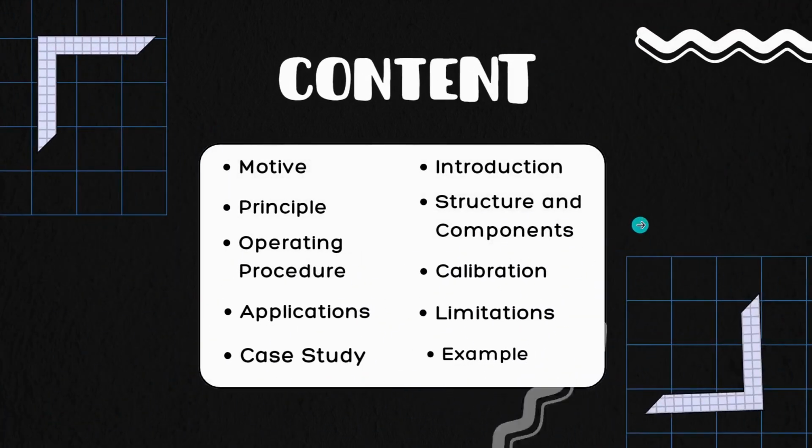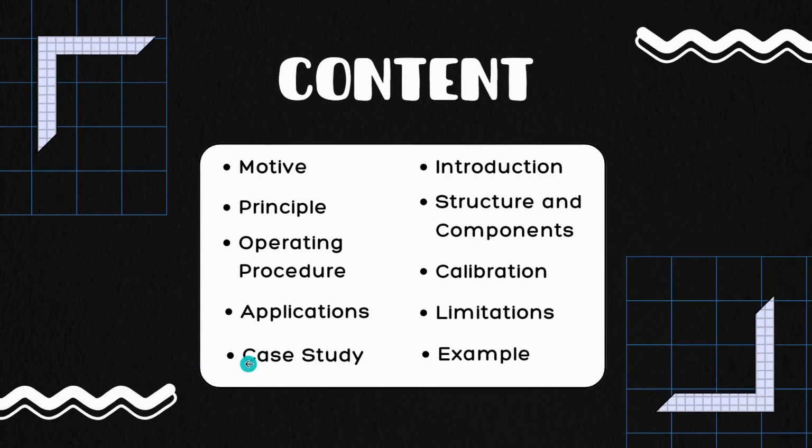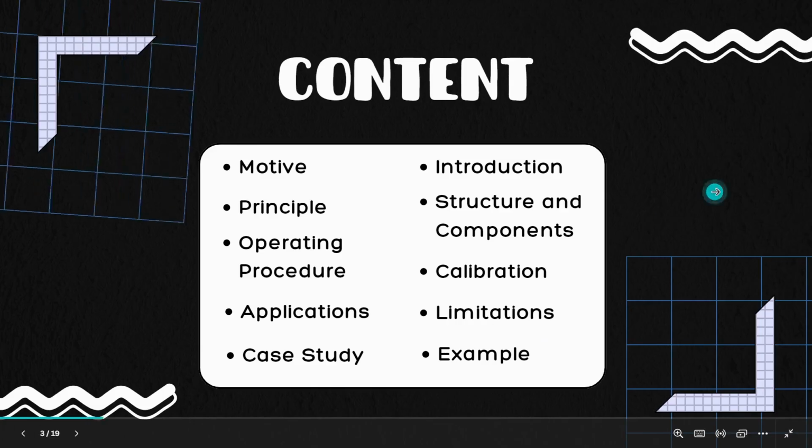So let's see the content in the presentation. First is the motive, second is the introduction, then principle, structure and components, operating procedure, calibration, applications, limitations, case study and example.